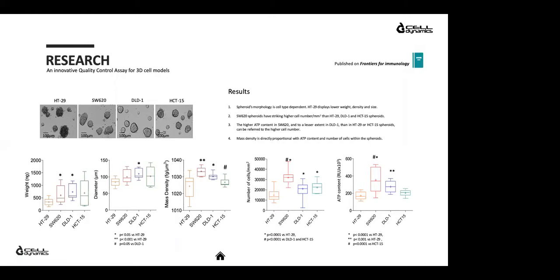It seems that spheroids of HT29, from a preliminary bright field investigation, have irregular and rough shape, while the other 3 cell types create more round and compact spheroids. We created spheroids in flat bottom ultra low attachment plates, starting from the same cell seeding number, but this cell line creates spheroids with different physical properties.